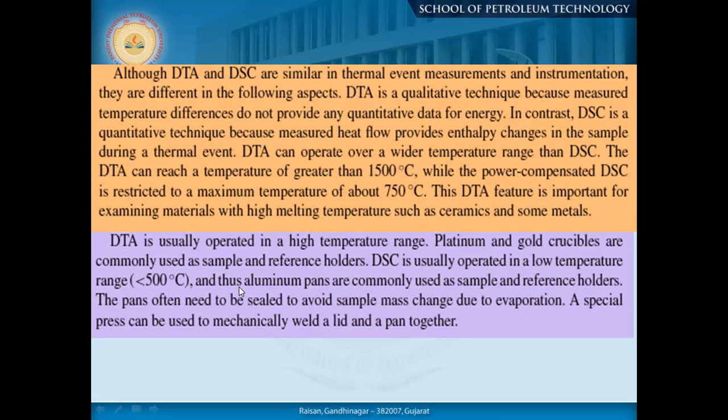So you can understand our aim for getting the thermal analysis done. What is the purpose of doing the analysis? Are we going for a quantitative analysis, or are we going for a qualitative analysis to understand what is happening? That is how you need to select. Sometimes, for saving instrument cost, we do the thermogravimetric analysis, then we put our sample in either DSC or DTA for getting much better quantitative or qualitative information.